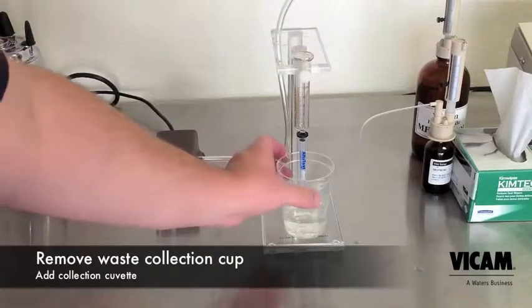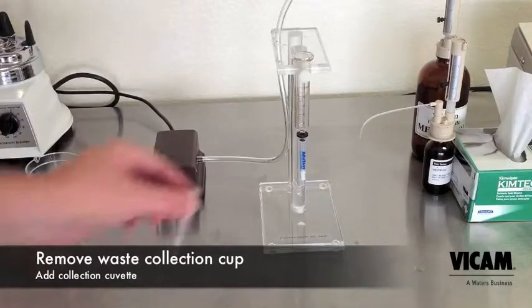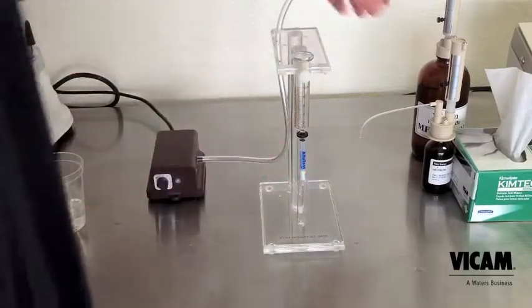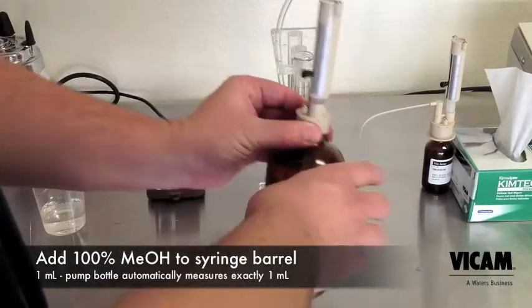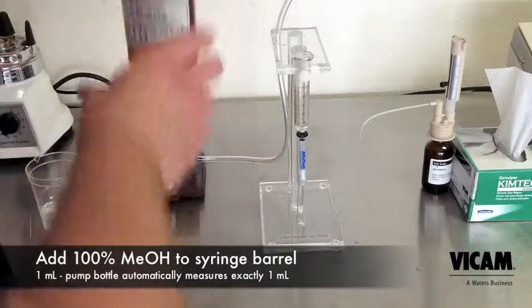Remove the waste collection cup. Place the collection cuvette below the column. Add 1 milliliter of pure methanol. Very carefully pass one drop per second through the column. Methanol is less dense than water, so it will flow quicker than in your last steps.